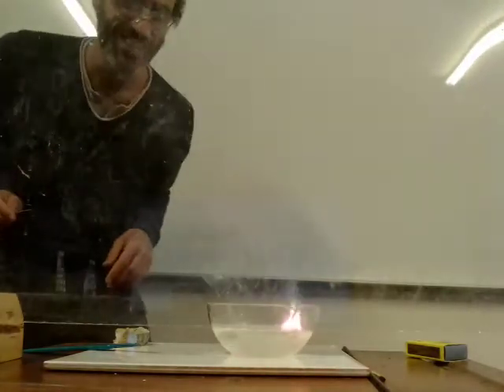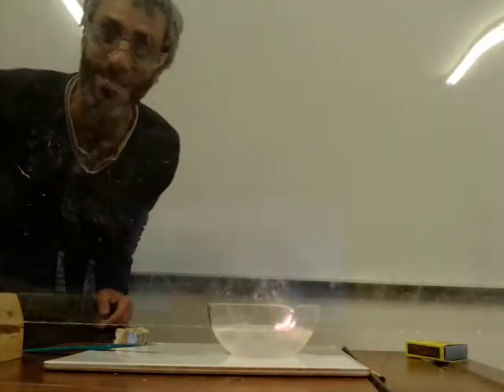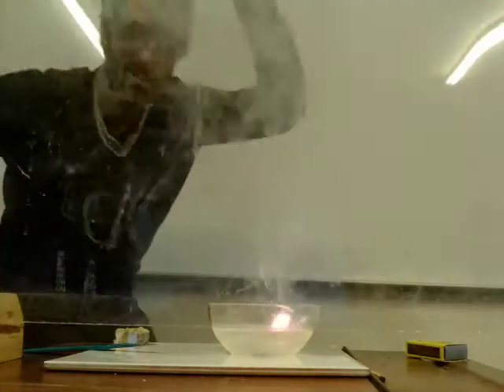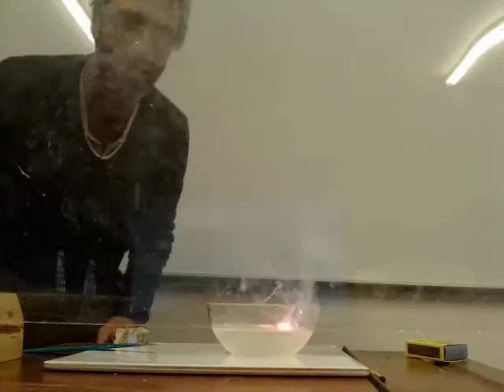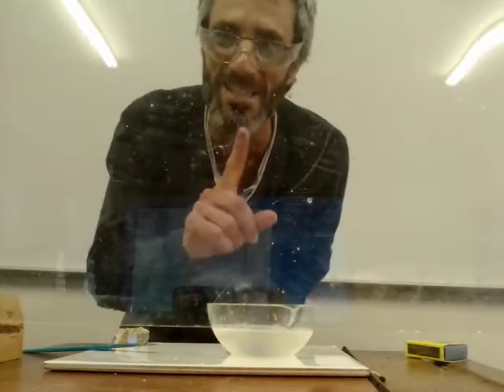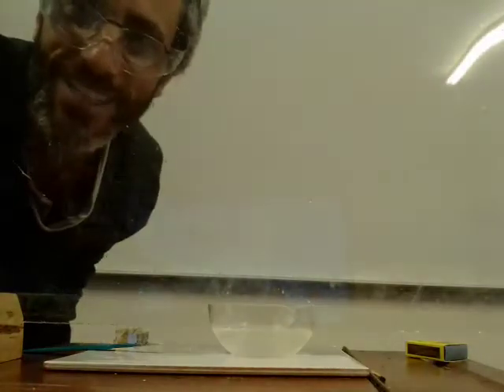Woo! Fantastic. Isn't that cool? Potassium. Very reactive metal. Sparks flying in the air. You can see it. Thank goodness I've got the screen, otherwise my laptop wouldn't survive. Okay, we're going to pause here. Move to the next reaction.